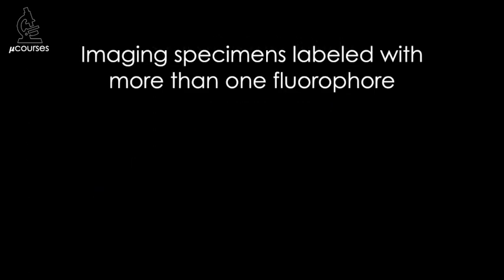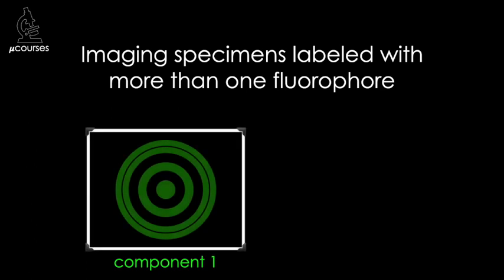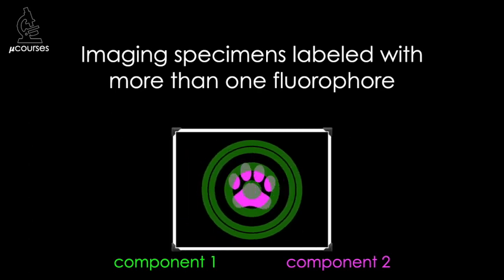Chromatic shifts are of particular concern when imaging more than one color or wavelength, as is the case when using fluorescence microscopy techniques to image specimens labeled with more than one fluorophore. For example, two components in the specimen are labeled with different fluorophores. Images of each fluorophore are acquired sequentially and then merged together computationally to demonstrate the relative localization of the two components.